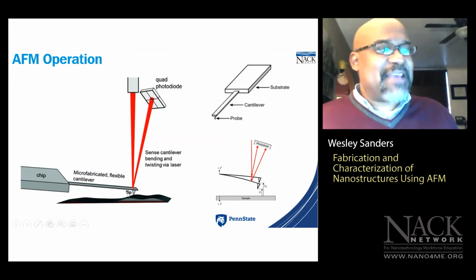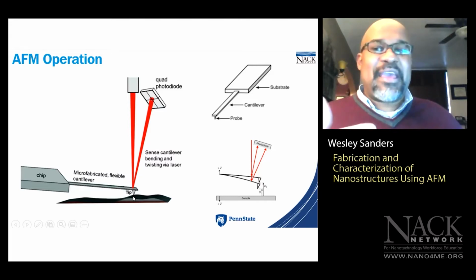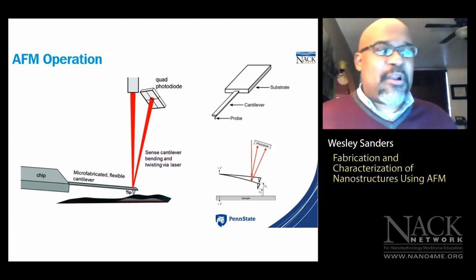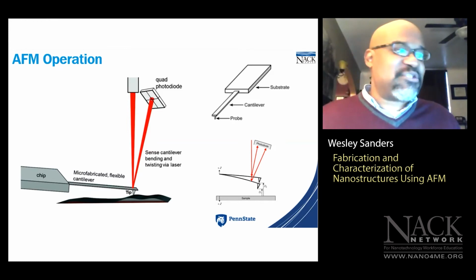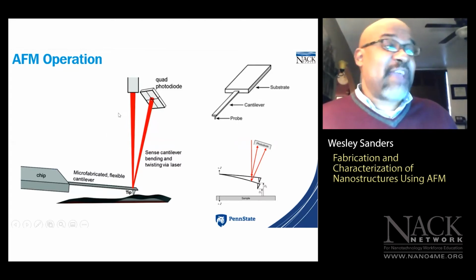Now the tip has nanoscale dimensions, right? So we can't see, using ordinary optical means, the movement of the tip as it traces the sample surface. So we have an elaborate setup of electronics that are used to monitor tip-sample interactions.